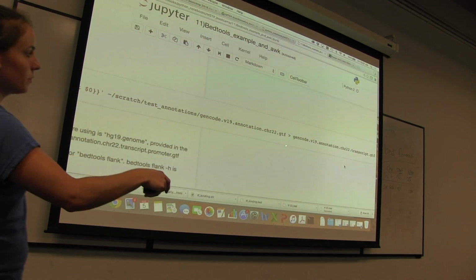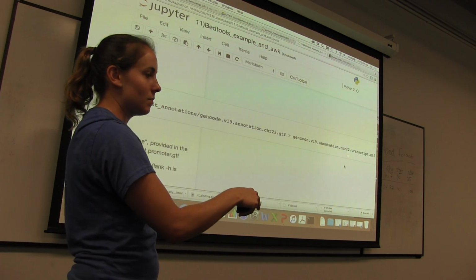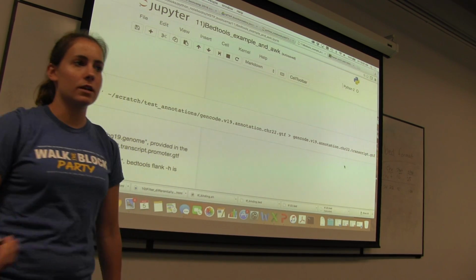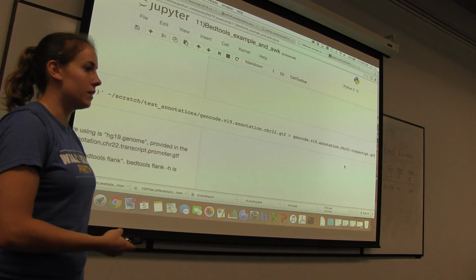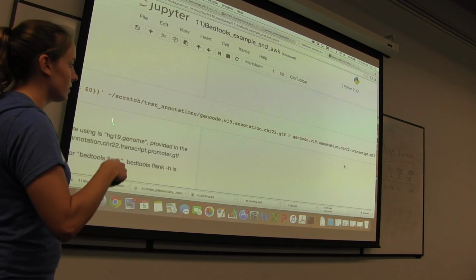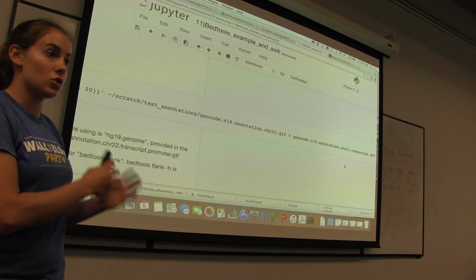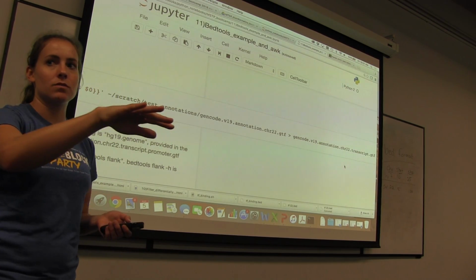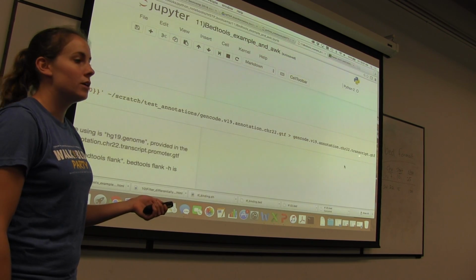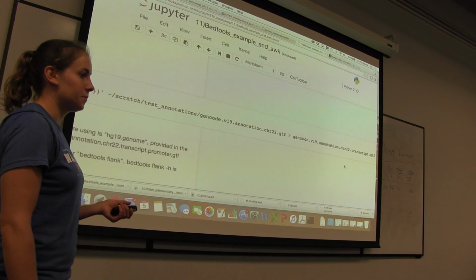And we're going to save the output of it to a new annotation file called chromosome22.transcript. So once you run this, take a look at your transcript file. You can look at the number of lines in it. You can look at it with less -S, which makes it easier to view. And you can see how this works. So we asked the question if the 3rd column had the value transcript. We wanted to keep the entire row in that GTF file, which will give us a GTF file that's specific to transcripts on chromosome 22 and not any of the other information that's in there.